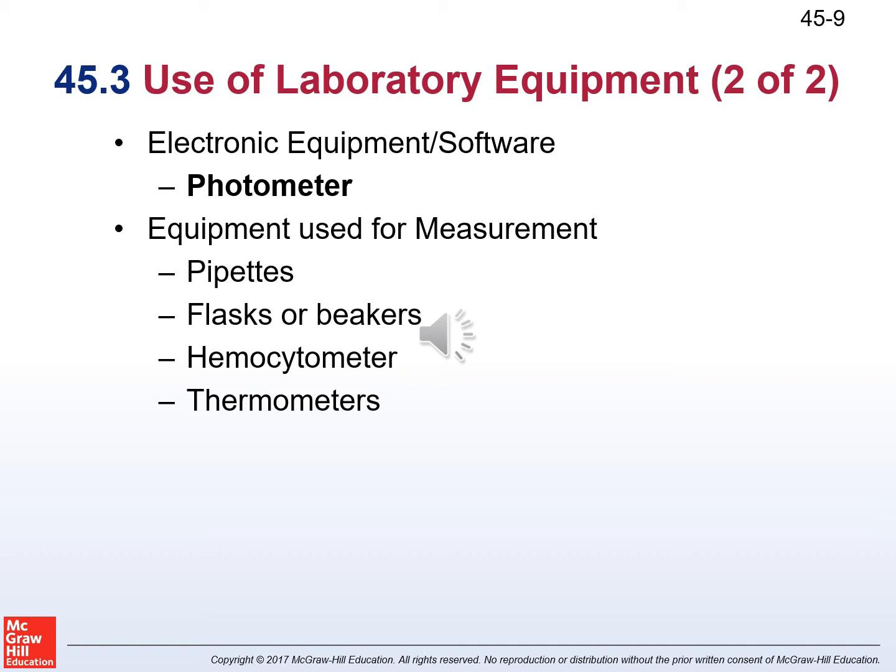Precise measurement is critical in the POL because it produces accurate test results. Metric system units are commonly used in the POL. A variety of equipment is used to provide accurate measurements.